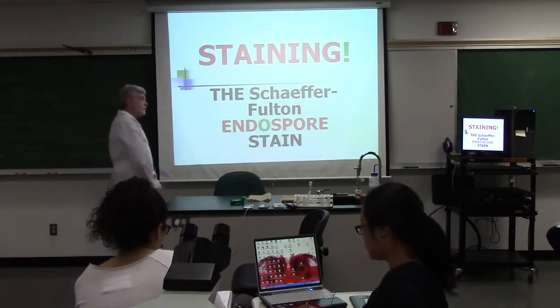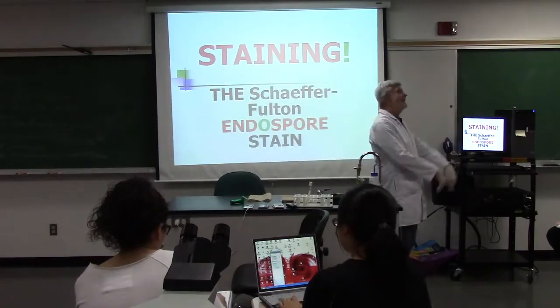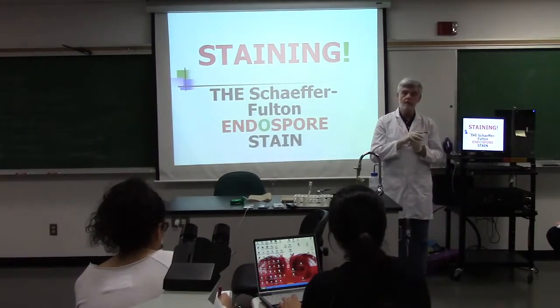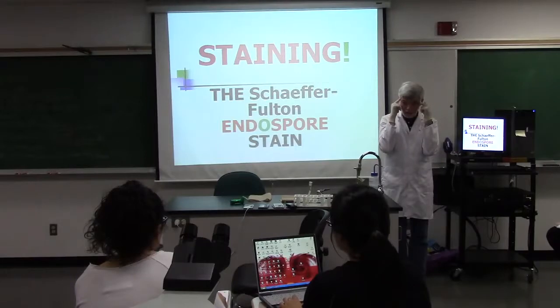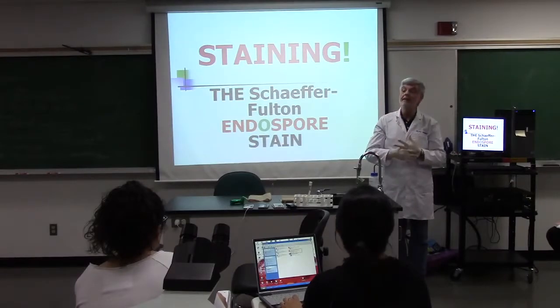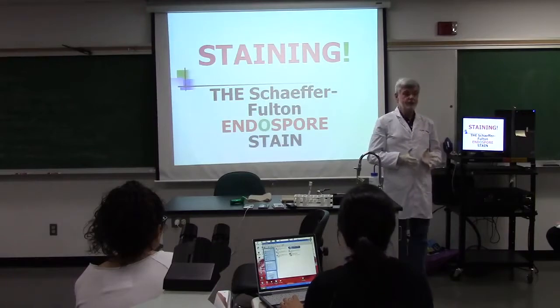Now, everything we've been told before about if it keeps the first color, it's positive, and if it keeps the second color, it's negative, is true. But if you trigger your mind on the word green, you're going to mess up when you get to the problem stains, the ones that are difficult to read.